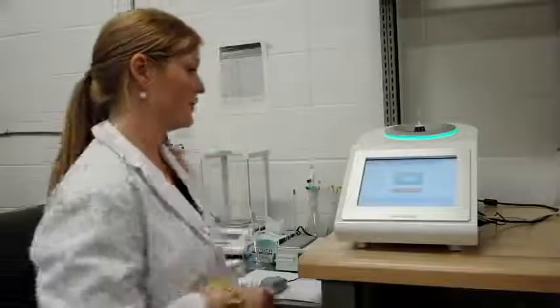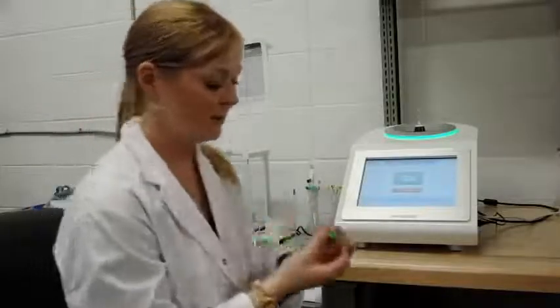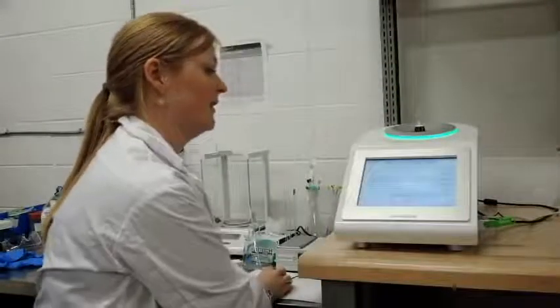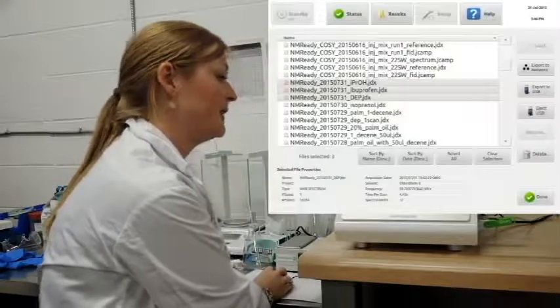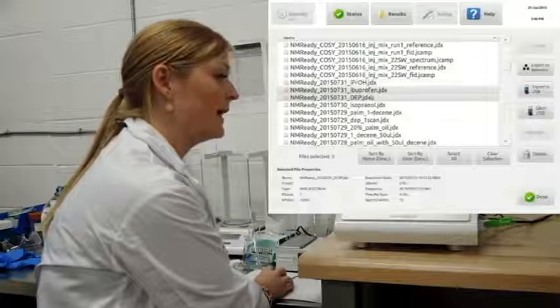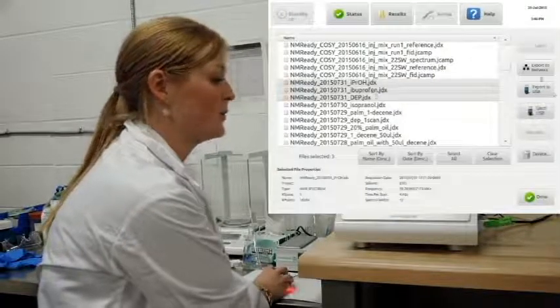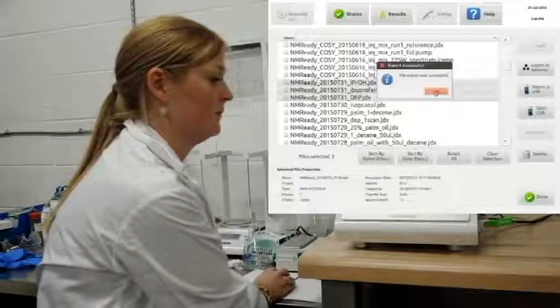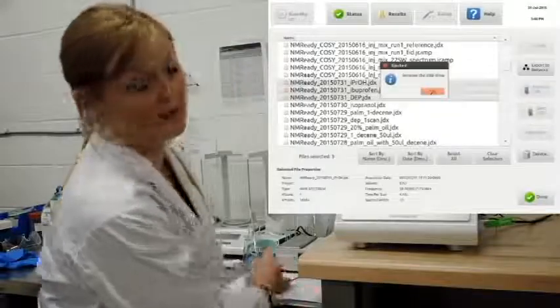So everything you've saved to the spectrometer gets put into this results folder. So it's very easy for you to use a network folder or a USB key. Go into the results, everything's saved by the day. You can select the files that we ran. They're highlighted here, and I can export them directly to the USB key and process them on my third-party software.